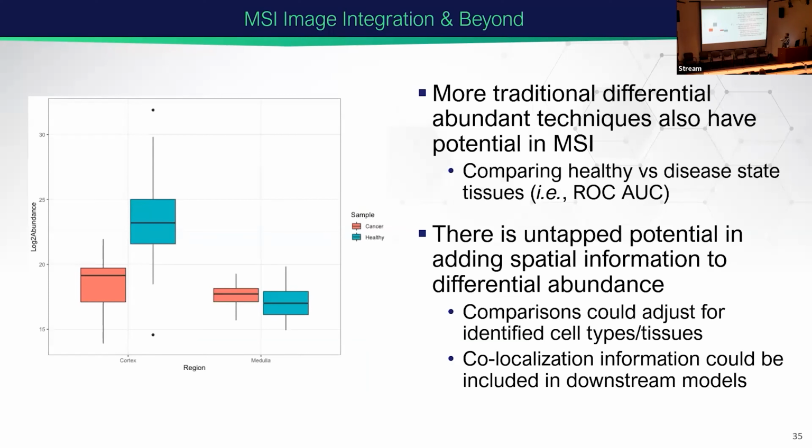Then more statistical bulk omics approaches. Sometimes we just want to compare if a specific biomolecule in the picture here, and we've got 2 regions of interest, is differentially abundant in 2 different areas of a tissue. This is also a potential end goal of segmentation. Once you have these regions and the mass spec imaging, you can move this along and do statistical analyses where you compare the differences between regions.